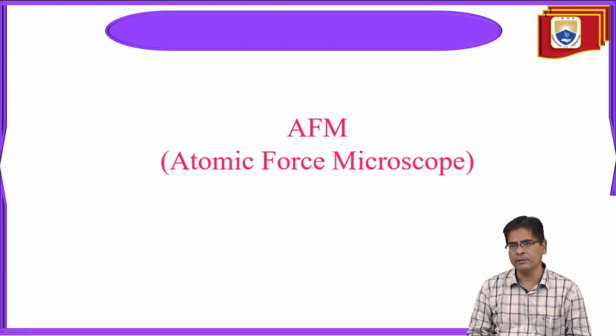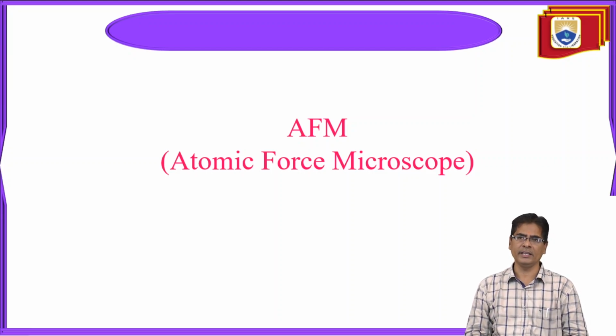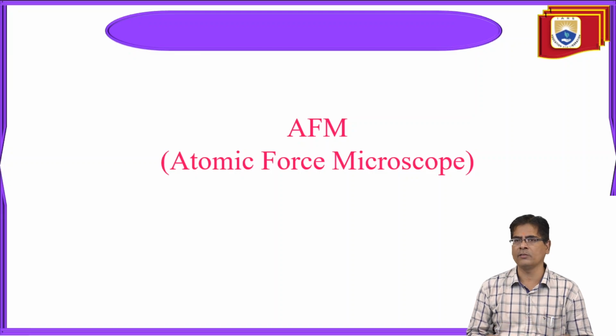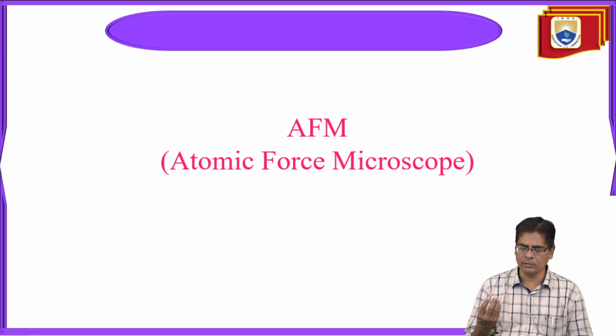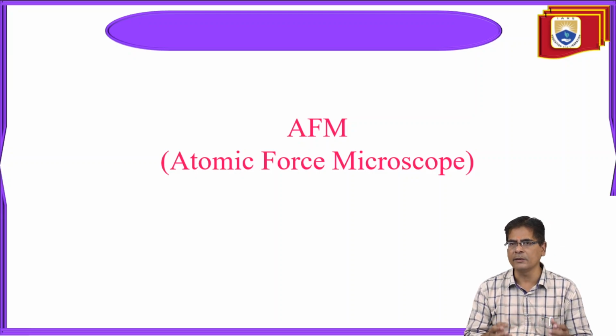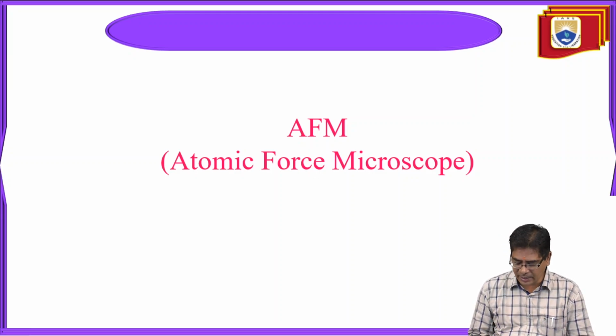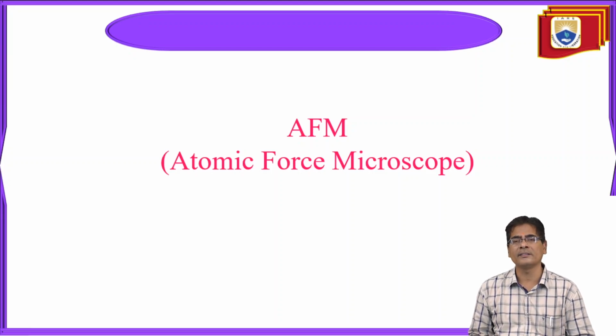Of course, magnetic force microscopy is used to characterize magnetic materials, whereas AFM, atomic force microscopy, is basically an instrument which is used to characterize all types of materials, irrespective of the domain. We can characterize any liquid material. But the main thing between AFM and MFM is the tip, a magnetic tip. This tip plays an important role in this type of microscopy. So let us see the differences between atomic force microscopy and magnetic force microscopy.